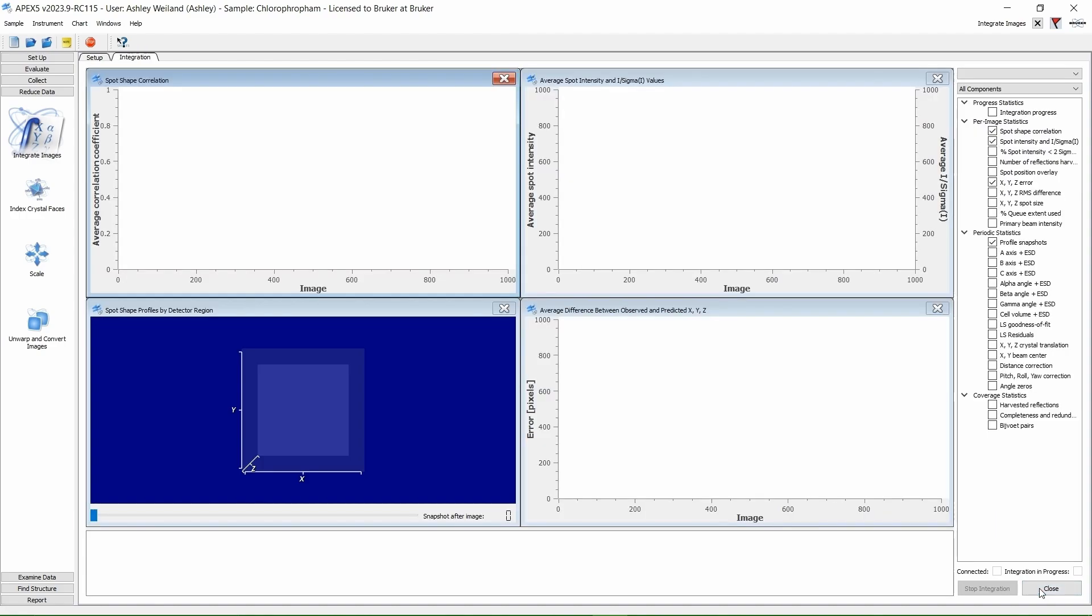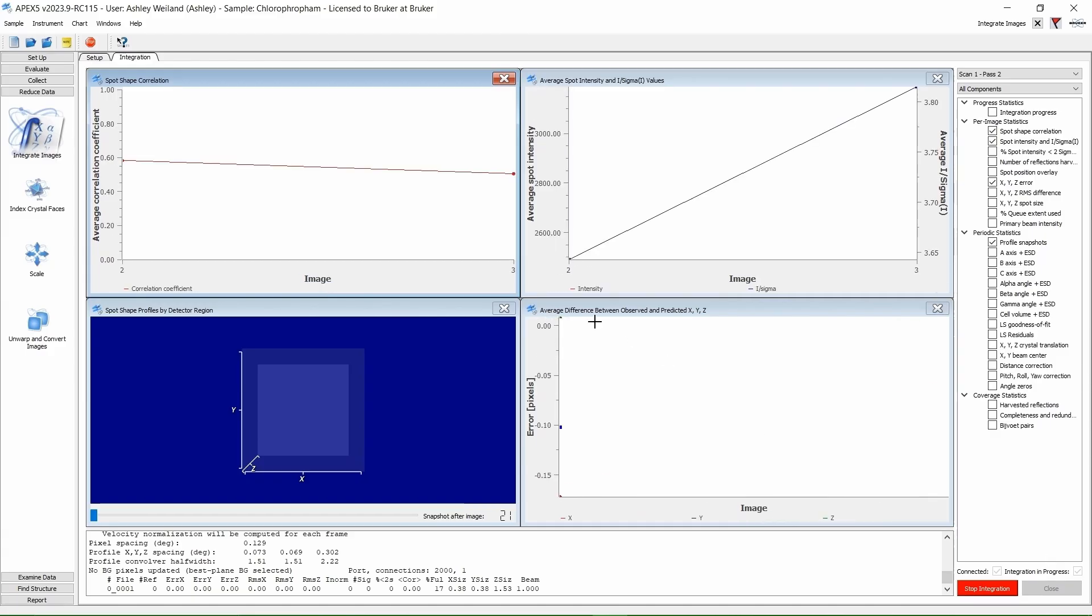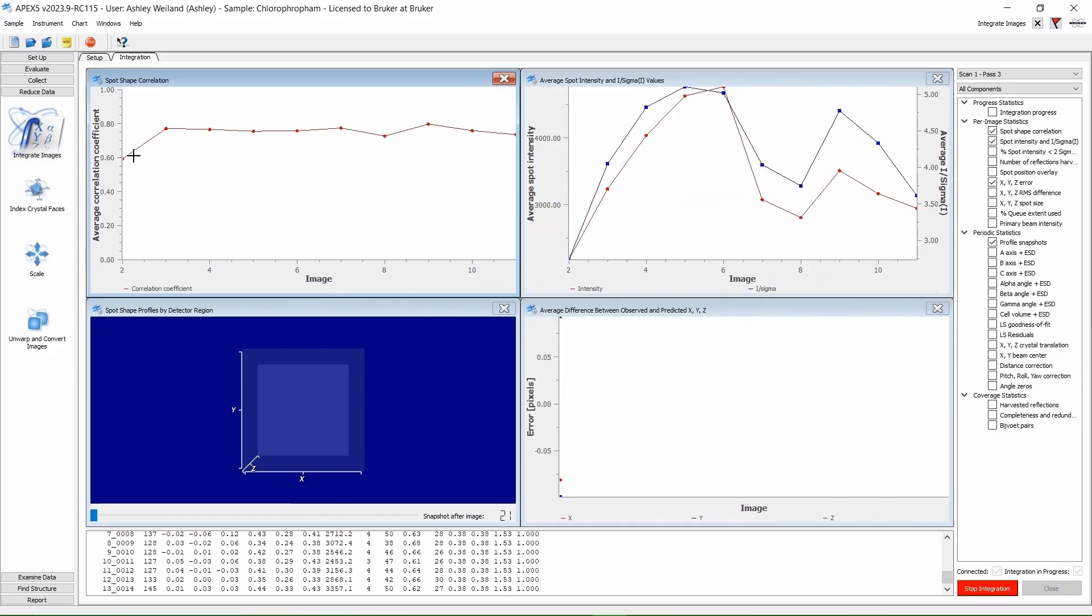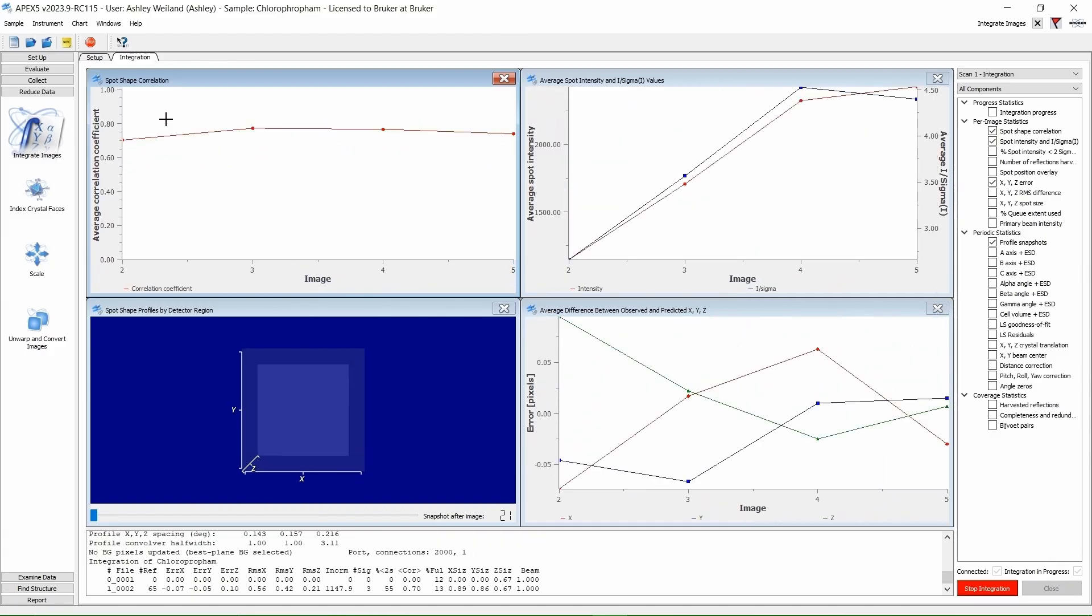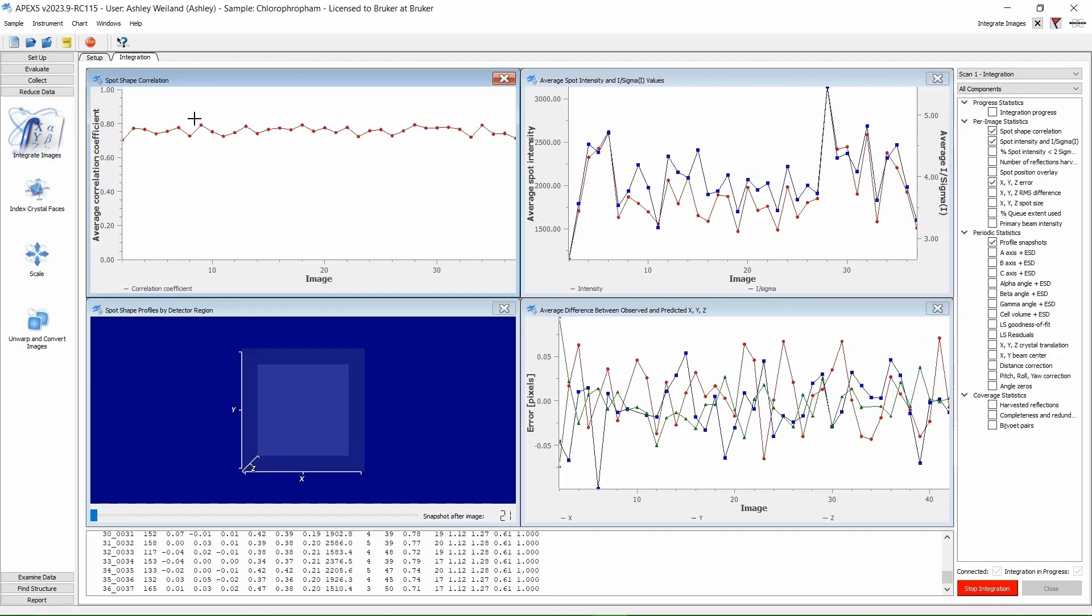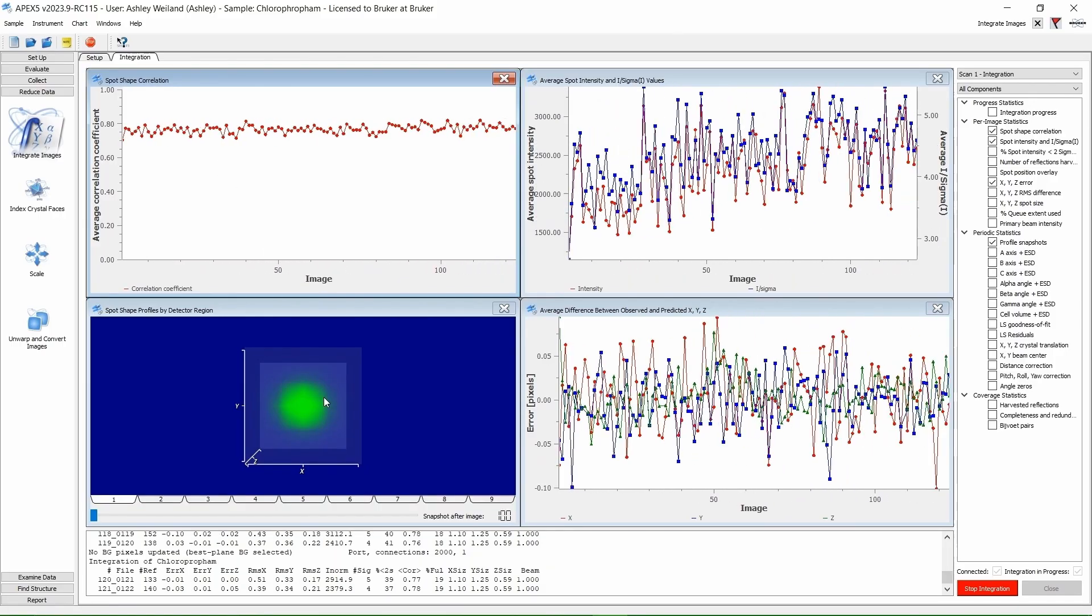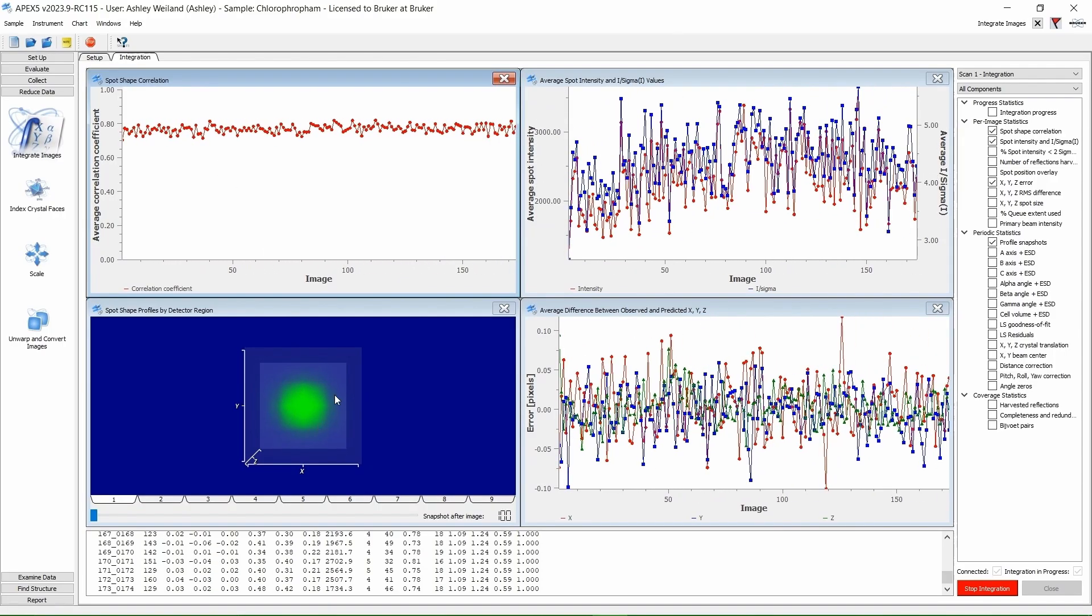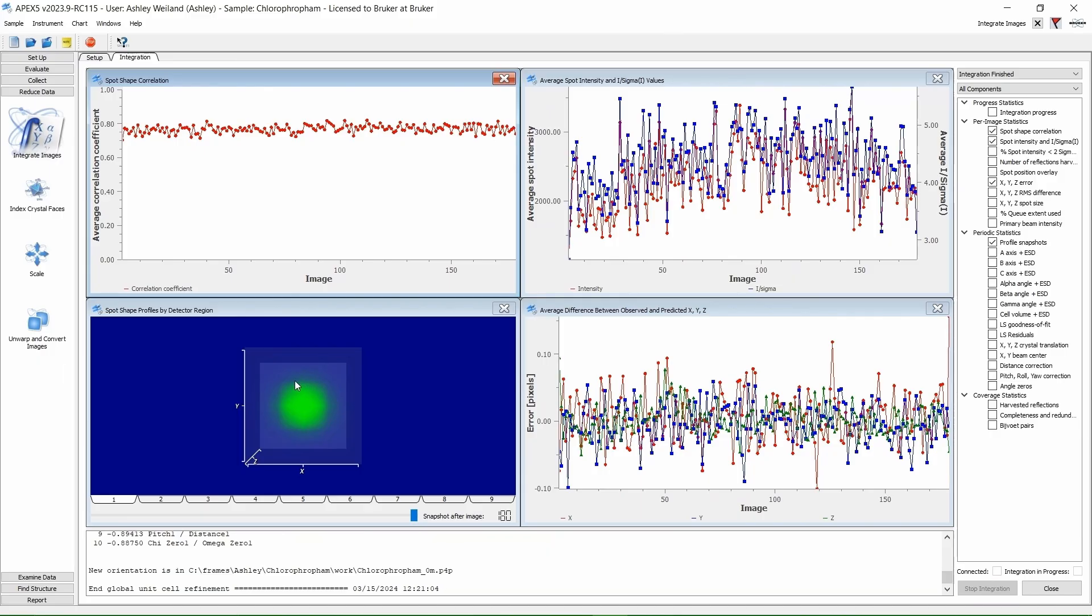On the top-left graph here, we want to see the spot shape correlation high and flat. On the bottom-left, we want to see a nice, round, green circle. Looks great! Click Close.